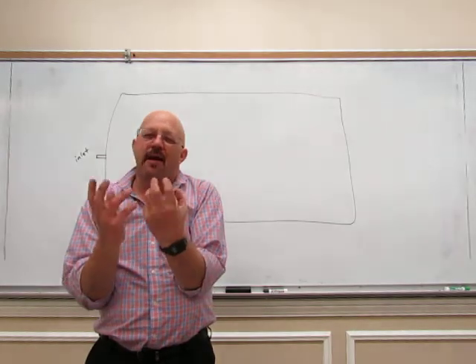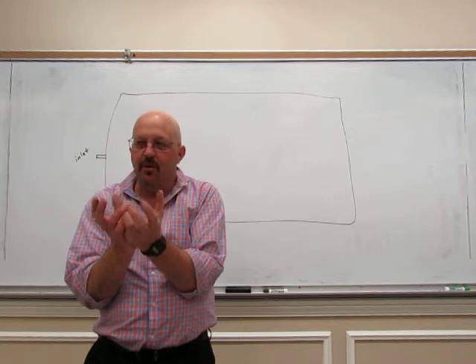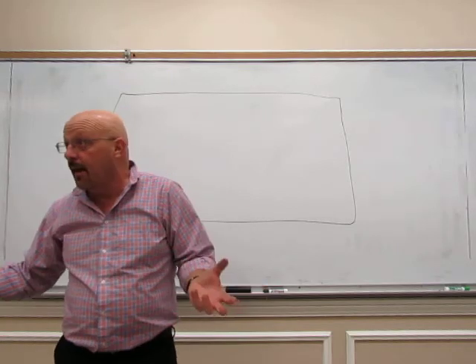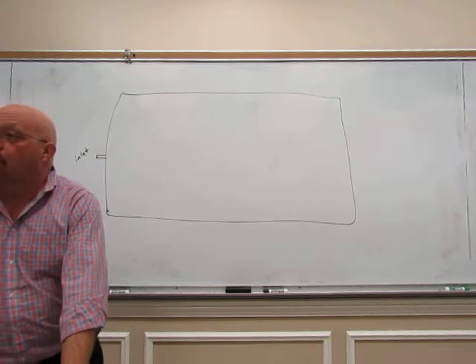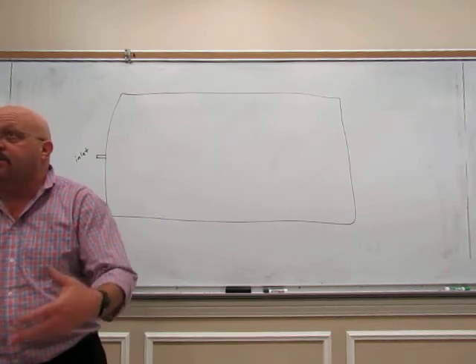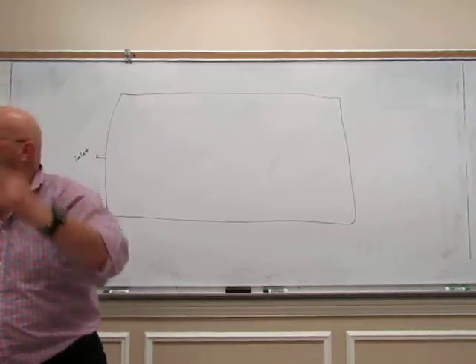We're dealing with very high energy species. High energy species means they're going to be very, very reactive. We do not want them reacting with anything because then they become something else, and we lose all of our information. We're trying to figure out what was our original structure, some of the pieces of it. But if they react with, say, oxygen or carbon dioxide or something like that that's in the air, then they become something else.